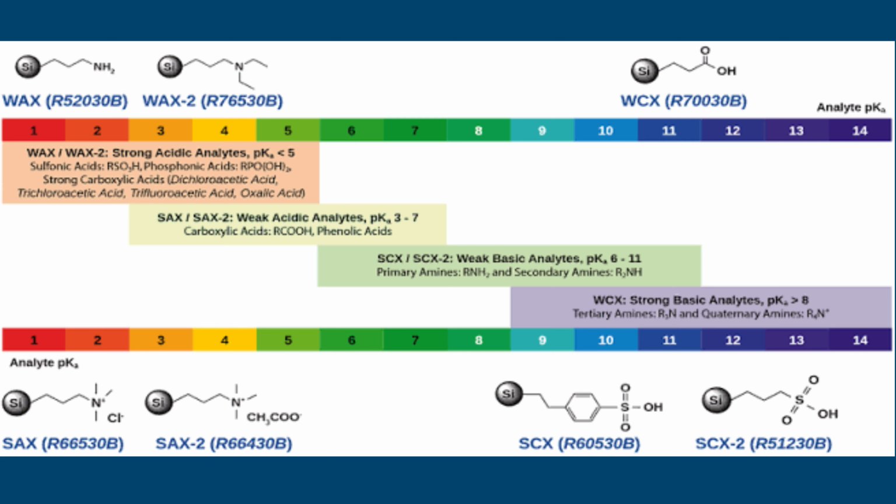The preparation of anion exchange resins is chemically more involved because chloromethylation is commonly followed by substitution with an appropriate amine. Specialty chelating resins incorporate ligands such as aminophosphonic, thiol, or other donor groups. These materials exploit both ion exchange and coordination chemistry to selectively capture metal ions.